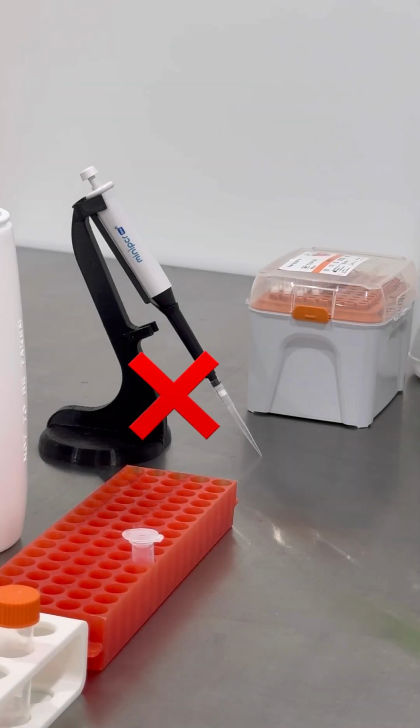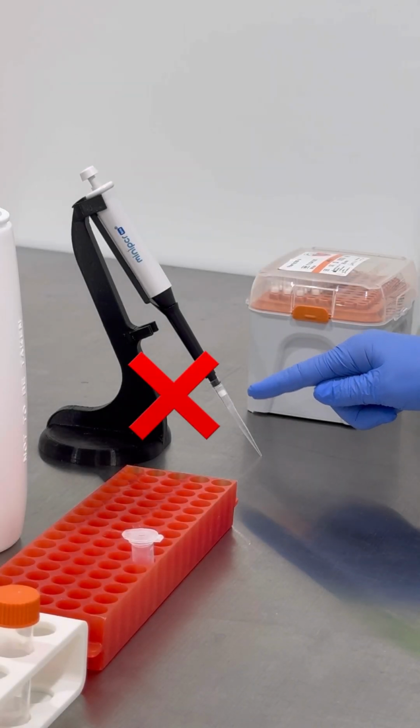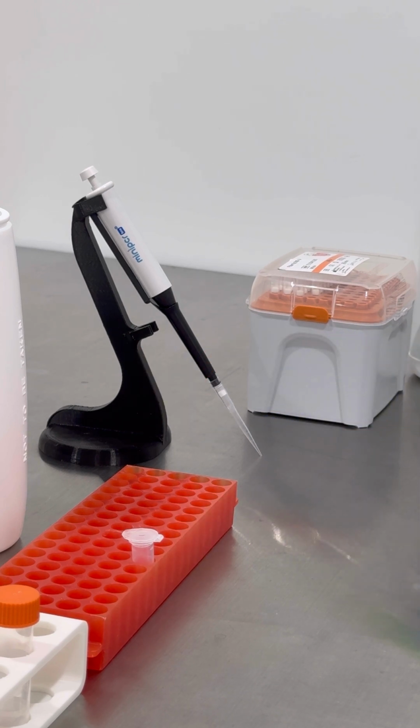Do not leave tips on the end of the micropipette when on the stand, as they will not stay clean or they might get used twice, creating contamination across samples and/or tests.